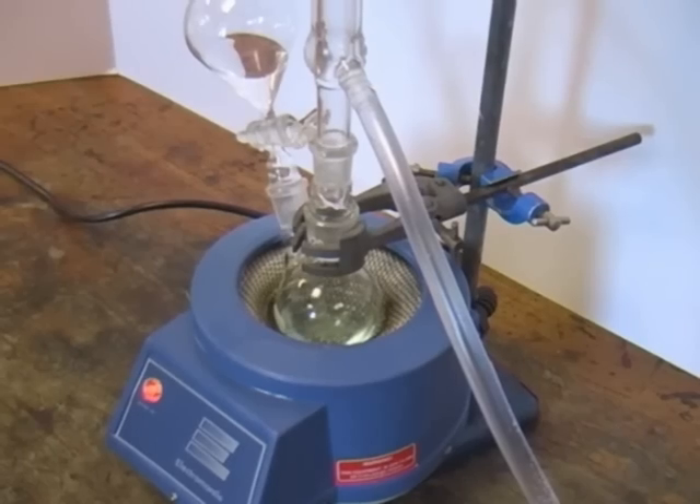You may be told how long you need to run the reflux for, or you may be expected to follow the reaction's progress, perhaps by TLC.